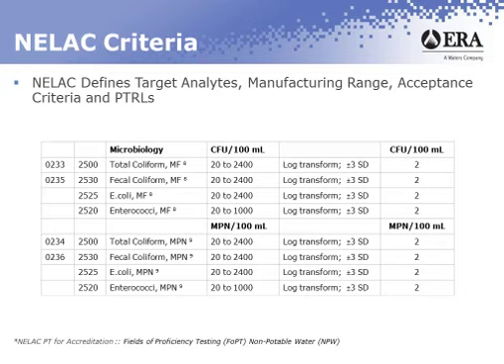It's something that's varied. Also on this design range, it's important to keep in mind that it is in fact just a range that we're designing our product to. It's not a range of acceptable results. A study designed at the lower end of the range may have a range of acceptable results which actually go outside of that design range. So if we make something at 20, it's very possible that the range of acceptable values will be below that. Or conversely, if we made it on the very high end, it's possible that the range of acceptable results would go above the high end of the range. So it's important to keep that clear.